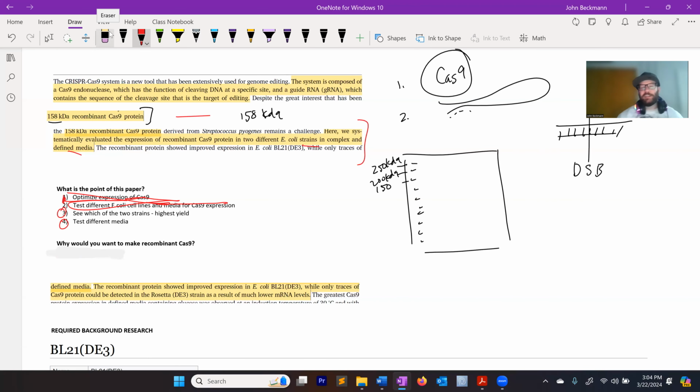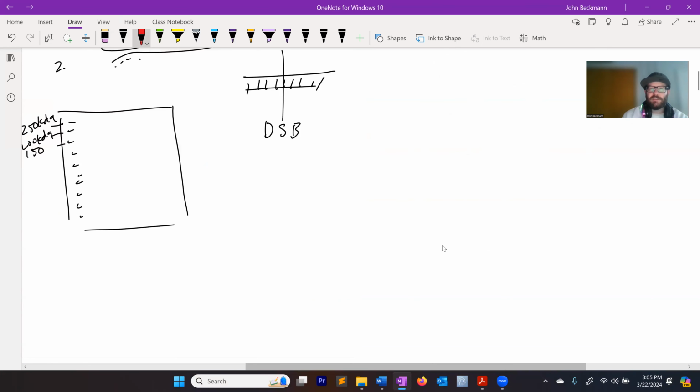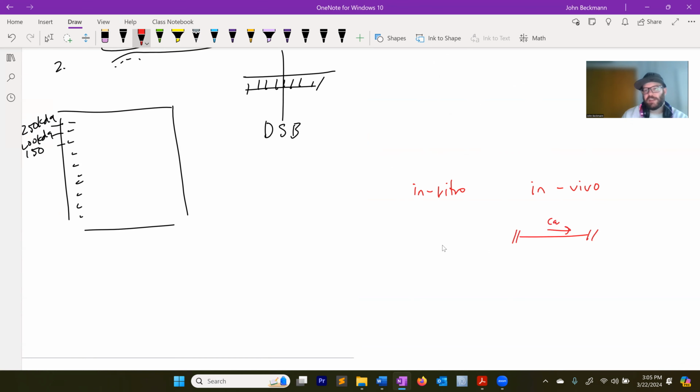So that's an interesting thing. Again, this is helpful for me to clarify. You said 2 things: in vitro versus in vivo. In vivo usage means in the living organism. In vivo usage of Cas9 would probably be something like a transgenic insert of Cas9 into the genome, although you can use recombinant protein for in vivo.